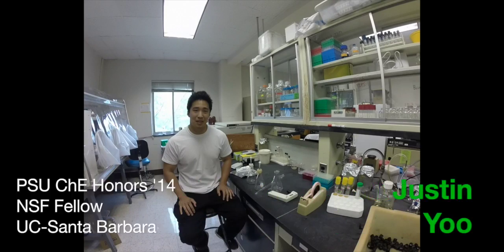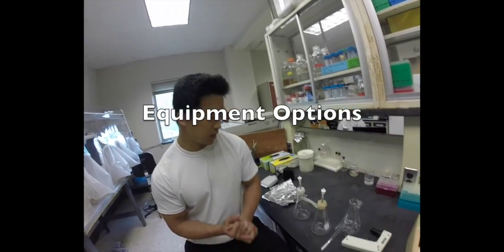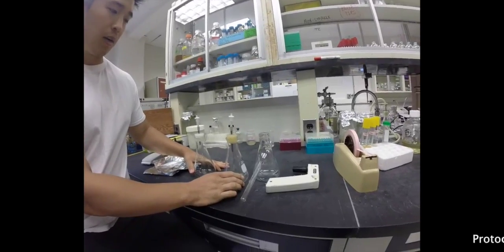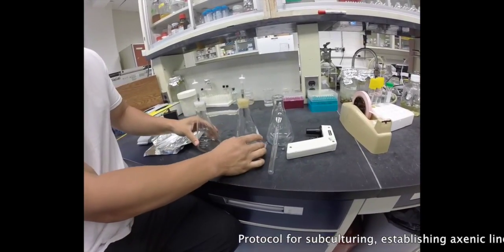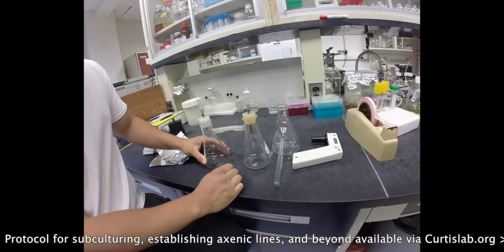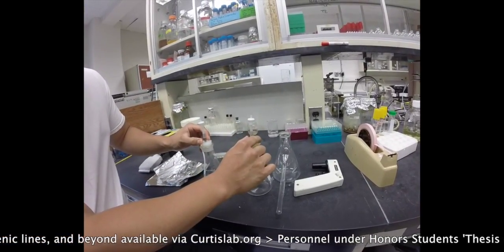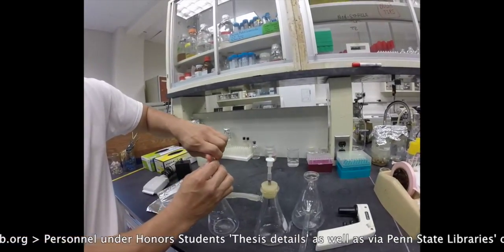Today we're going to go over axenic Botryococcus subculturing and inoculation. So these are the vessels that I usually maintain the axenic cultures in. Just for regular maintenance, if you don't want to check up on the OD, you can use 2 vacuum flasks, connect them using autoclavable tubing, and put 2 stoppers in here. And I put these filters in, which are connected by luer locks here.